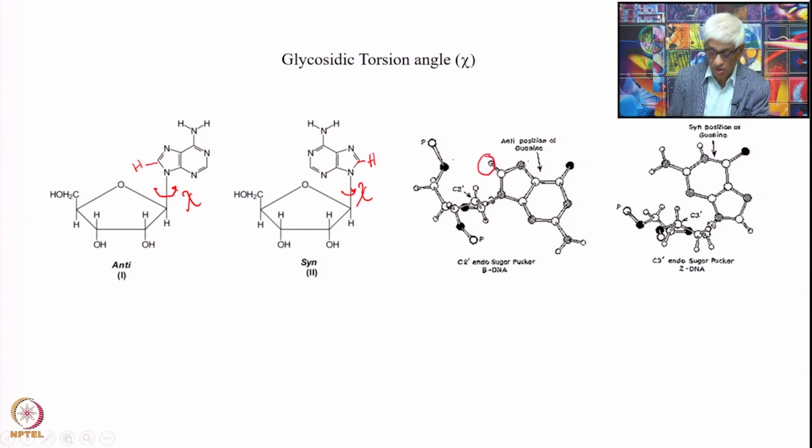You see this proton comes closer to the oxygen of the sugar ring here. Whereas that proton is far away compared to the oxygen, that is this one here, this is far away as I mentioned.